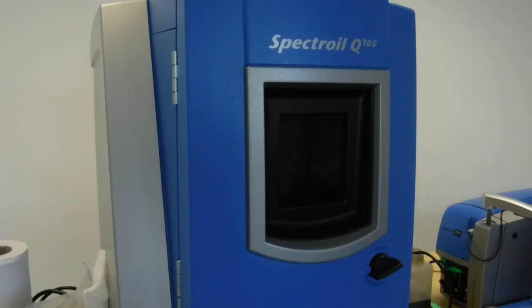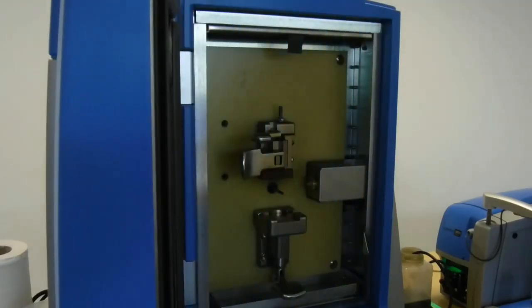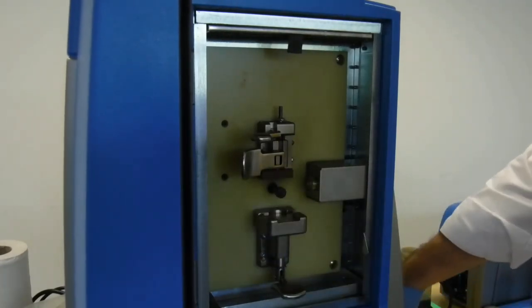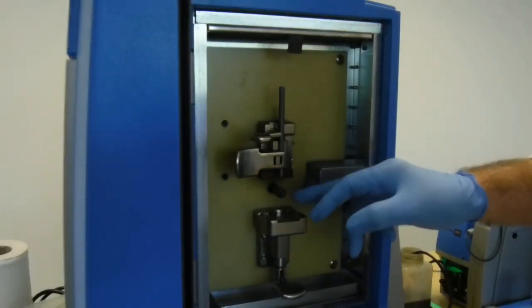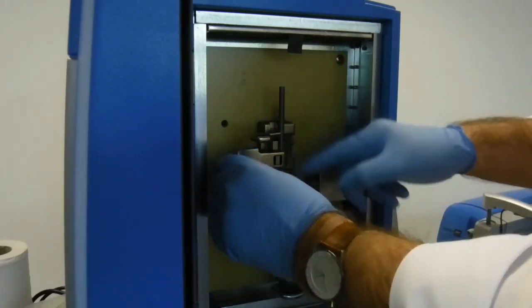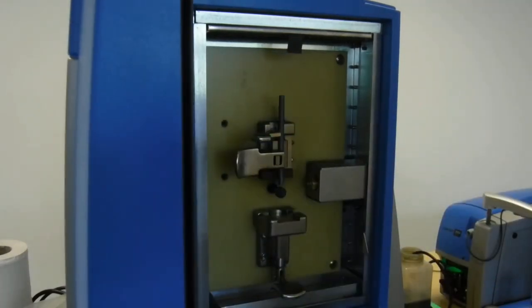Okay, so having explained the overview of the systems, let's now drill down into how we actually perform the various tasks. We'll start with the wear metal analyzer here. First of all, we need to prepare it for analysis. Very simply, we take a graphite disc, place it on the spindle, we take a graphite rod, clamp it in here. This is going to generate our electric spark, which will then excite the atoms in the oil sample, which will be in a little cup just down here. We need to set the gap there. It's very simple. Just drop that down there, lift that lever up, it's done.